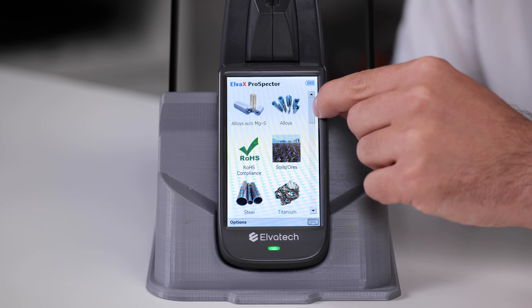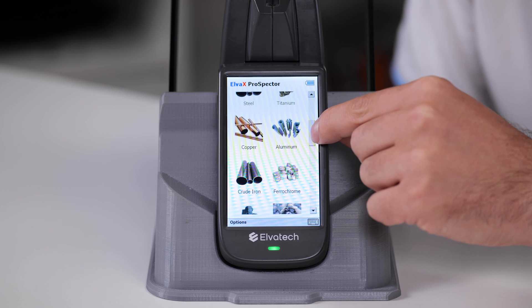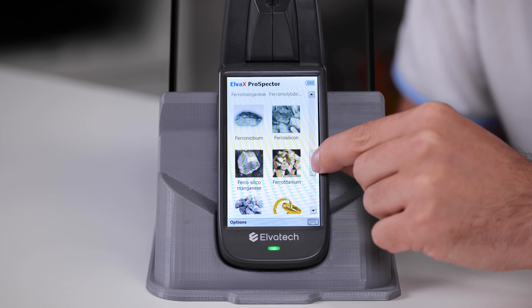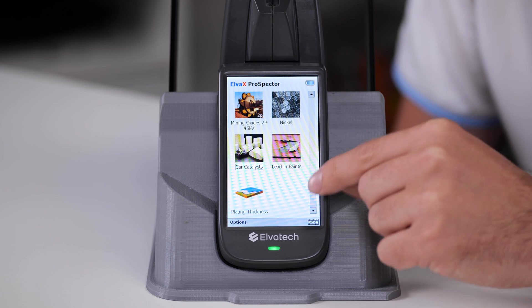Second, choosing the right calibration. When selecting a calibration, make sure it is appropriate for the types of sample you are going to analyze. For example, if you are working with alloys, use the calibration for alloys and not for other types of materials. If you are interested in precious metals and autocatalysts, the autocatalyst calibration would be appropriate. If you are interested in analyzing gold, choose precious metals calibration. In both cases we are interested in precious metals, but different calibrations are used for these tasks.